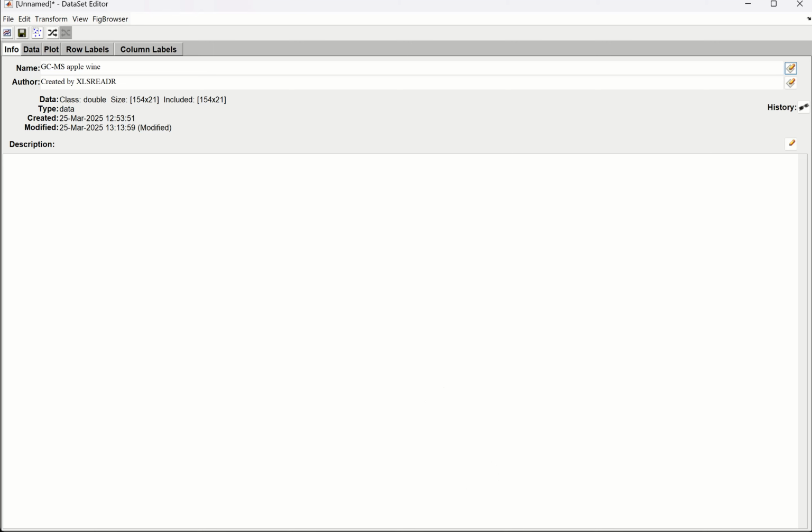Now, I want to show you, corresponding to this plot, the actual quantification in the different fermentations. We can just click here in this plot and have a look. It might be a little bit hard to see, but I hope you can see the green crosses here. Now there are actually 2 fermentations of one organism, another one and another one. They're organized slightly differently in the other data set, so they appear on top of each other. But that's not the important point.